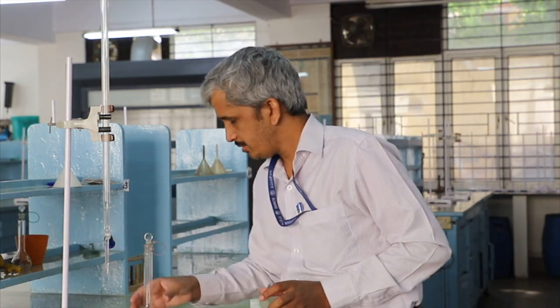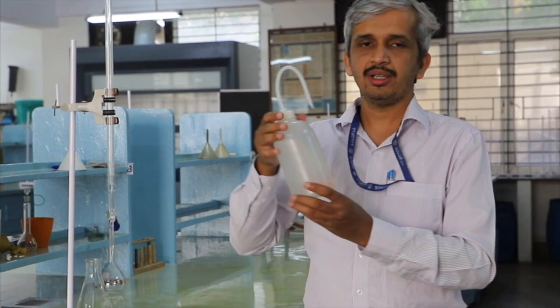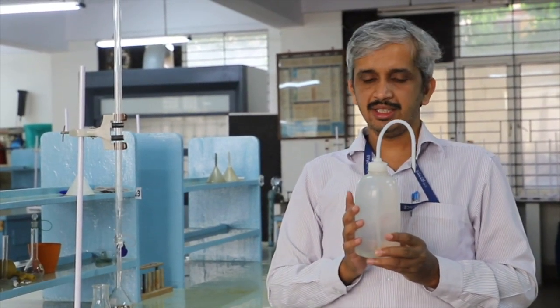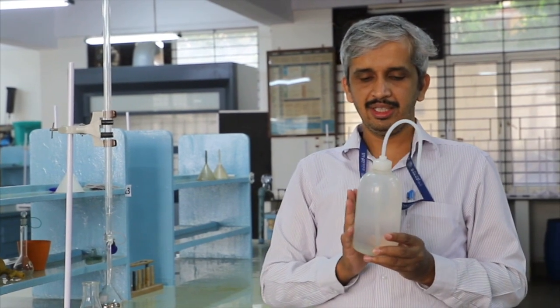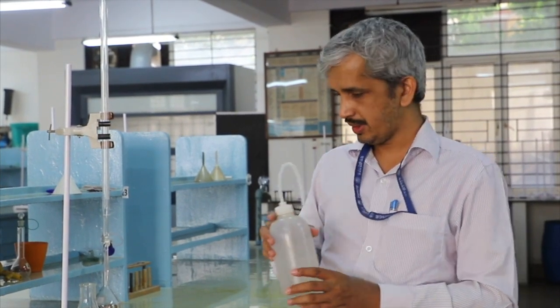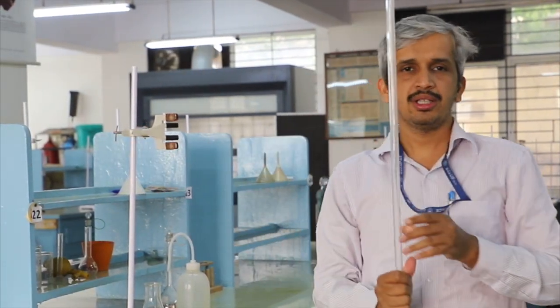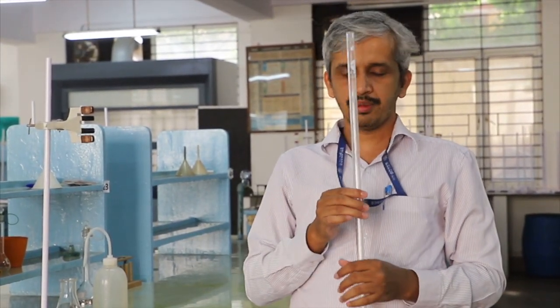Then how to handle this apparatus once you come inside the lab. The first thing is that we have here a plastic bottle. It's called a wash bottle. This bottle will always be filled with distilled water, so you can use this for the rinsing process. Once you arrive inside the laboratory, the first thing is you have to wash all the apparatus. Whatever apparatus you have collected against your name should be properly washed.